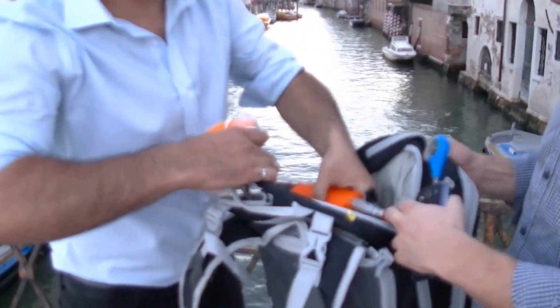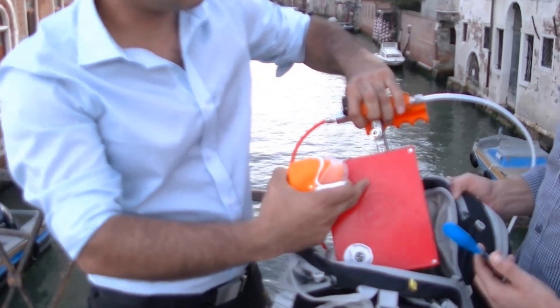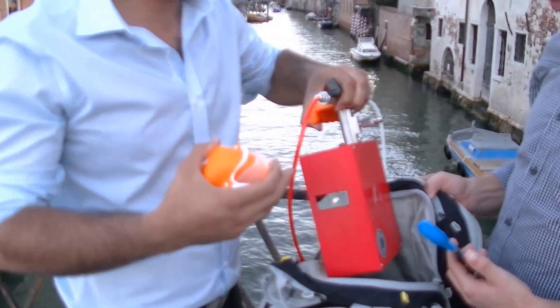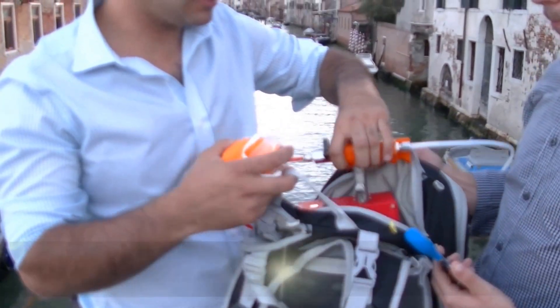Let's take a look at the hardware inside the bag. So most of you remember the SM100 had a manual dilution, but now we've added this box to it. Inside the box is a servo, a microcontroller, and a battery, connecting via Bluetooth.